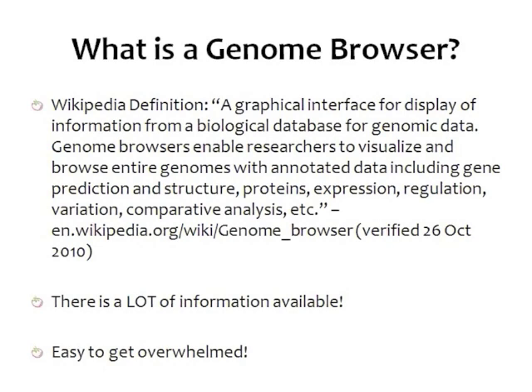Just to give you a definition of a genome browser: Wikipedia defines it as a graphical interface for the display of information from a biological database for genomic data. Genome browsers enable researchers to visualize and browse entire genomes with annotated data, including gene prediction and structure, proteins, expression, regulation, variation, and comparative analysis. There is a lot of information available, and it's very easy to get overwhelmed.